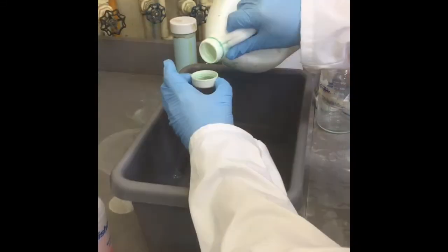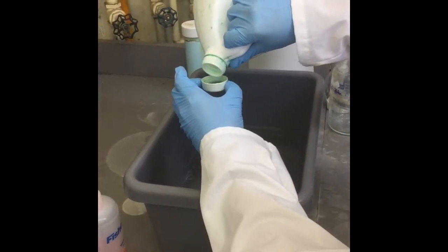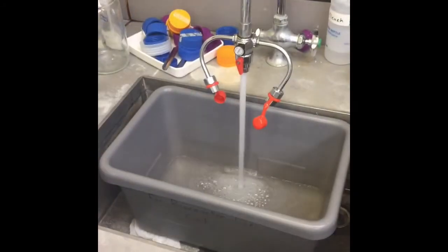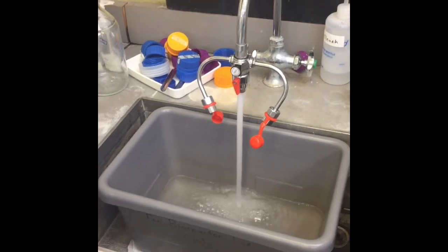Any glassware that was exposed to E. coli is soaked in a detergent bath for 15 minutes. Any disposable material contaminated with E. coli, such as gloves and pipettes, is disposed of in a designated biowaste container.